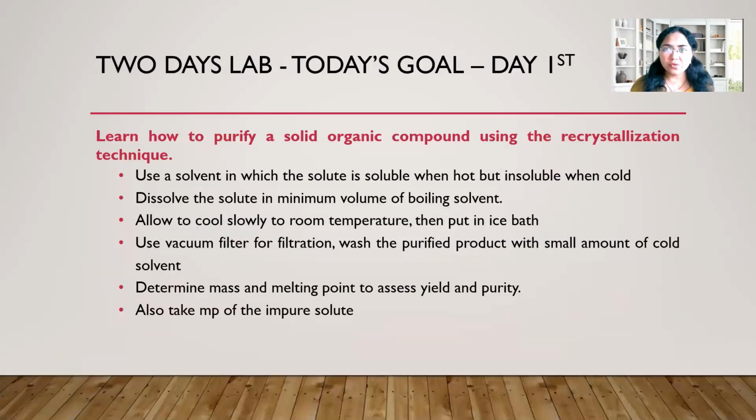So we will take 2 days to complete this experiment, and today's goal is to learn how to purify a solid organic compound using the recrystallization technique. In this technique, use a solvent in which the solute is soluble when it's hot but insoluble when it's cold. Dissolve the solute in a minimum volume of boiling solvent.